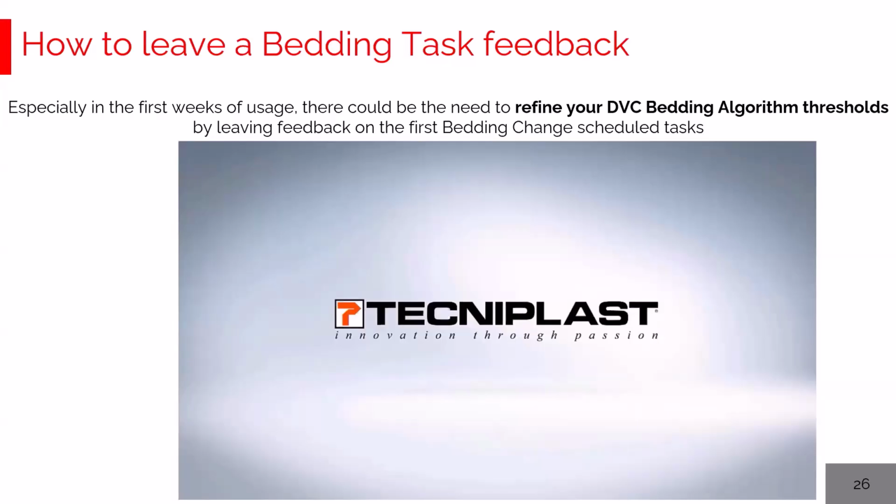These feedbacks usually are left just after the installation, for a certain number of tasks. If you are lucky, we can choose for you the most suitable thresholds already created by others. Usually it takes a few weeks or at least a few months, no more, depending obviously on the number of feedbacks needed to refine this algorithm and reach your level of satisfactory performance.